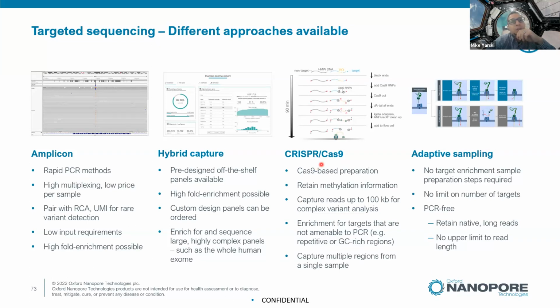And there's now going to be a 24-plex being released later this year on the Kit 14 using exonuclease digest at the library. So you can multiplex up to 24 samples. And of course, the team at Auckland is really great at the adaptive sampling.